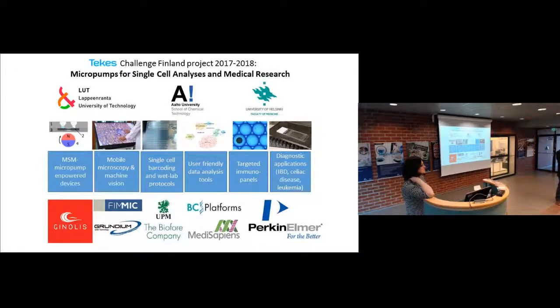No question? I have a last one. We see that the devices are miniaturized more and more, and we can understand why. But is there a need to go further? And if yes, why? Well, I think now when we think of single cell work, the cells will always be the same size. So for those cell diameters, this is now probably the smallest we can go.